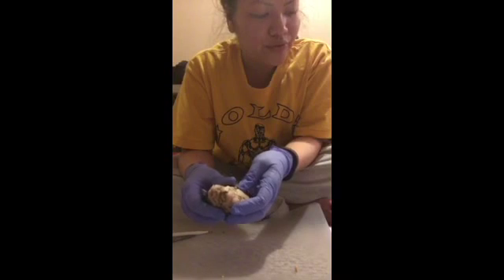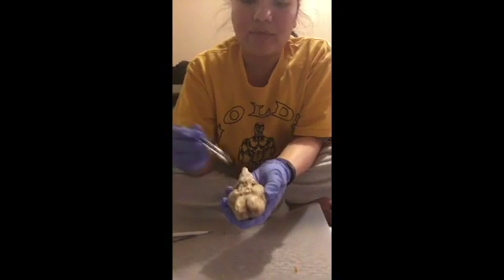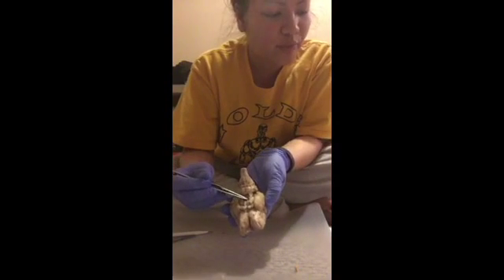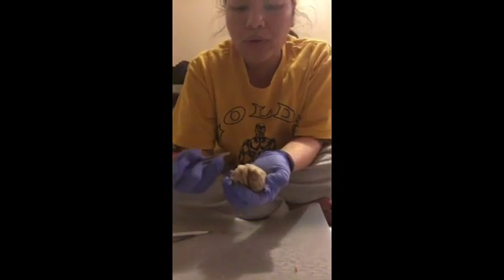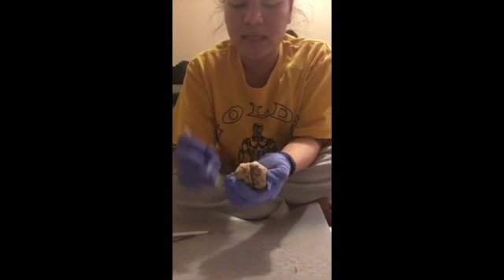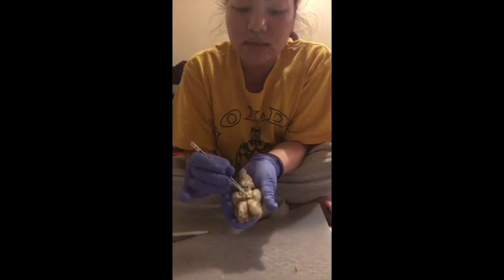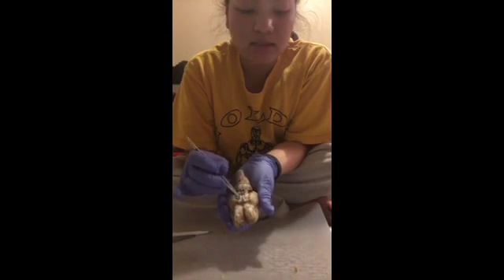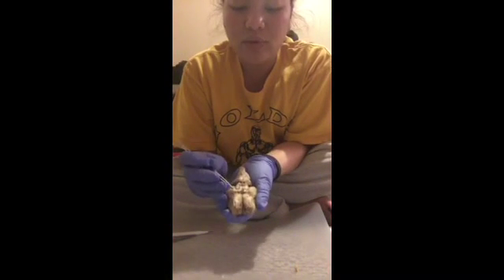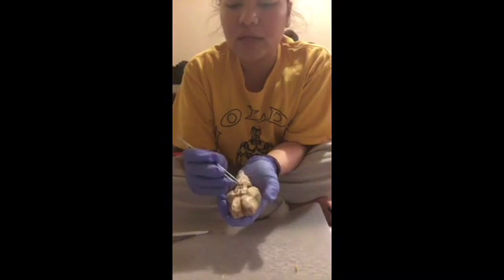Okay, now we're gonna go to the deep structures. This is the midbrain right here. In between, that's the midbrain. And the corpora quadrigemina. So the corpora quadrigemina is this part. Kind of came off, but it's that part. And it's divided into left and right superior colliculi and left and right inferior colliculi.